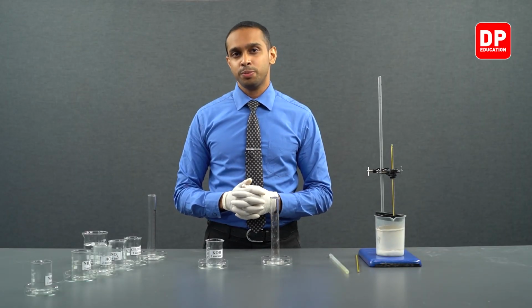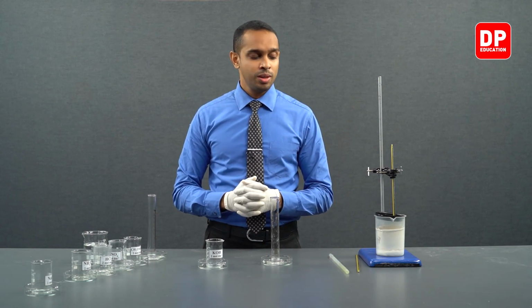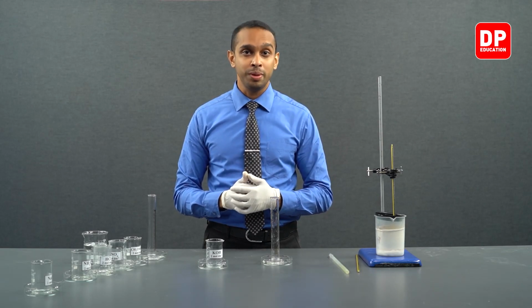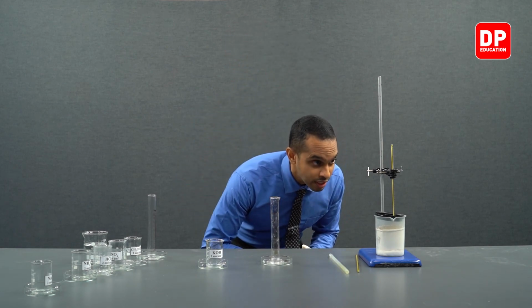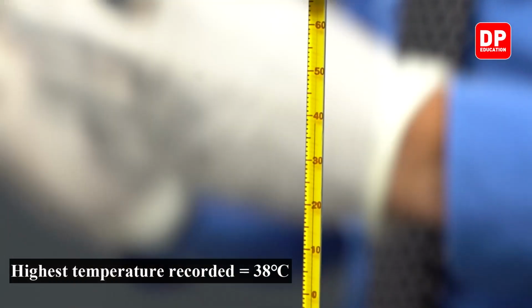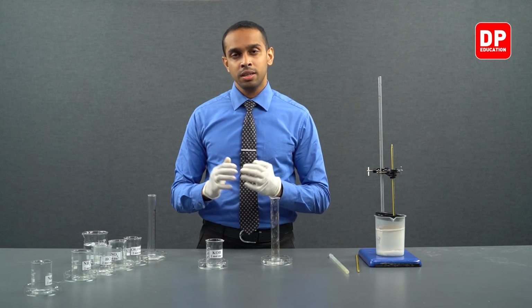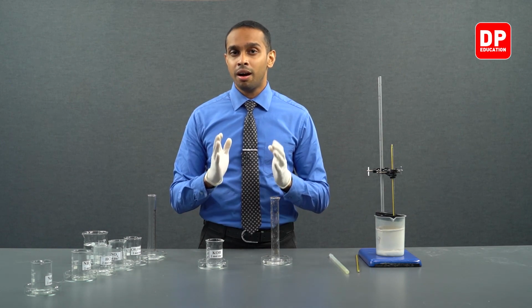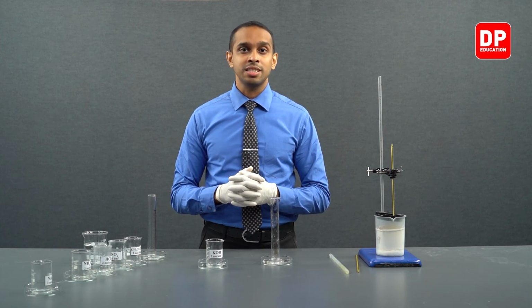In this second part of our experiment, after reacting potassium hydroxide with nitric acid, we allowed the reaction to proceed for about 2 minutes, and we recorded the highest temperature that it has reached. According to our observations, the highest temperature that it has reached is 38 degrees Celsius. Initial temperature of the acid was 26 degrees Celsius. Initial temperature of the base was 25 degrees Celsius. And the final highest temperature of the reaction mixture was 38 degrees Celsius.